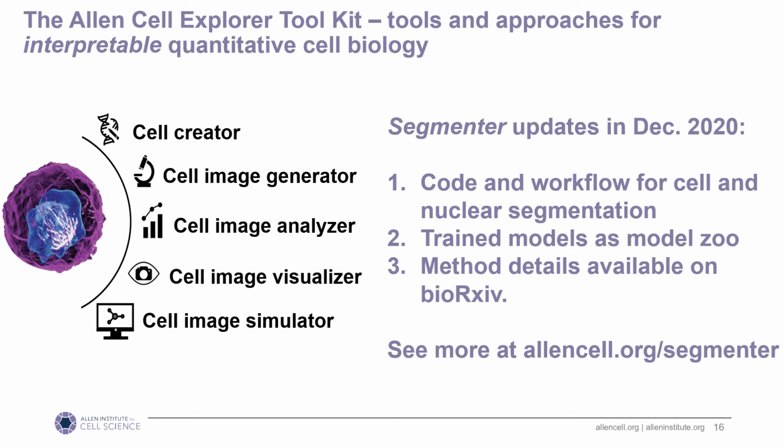By the end of this year, our Segmenter will be updated with cell and nuclear segmentation code and trained models. More details will be on bioRxiv.